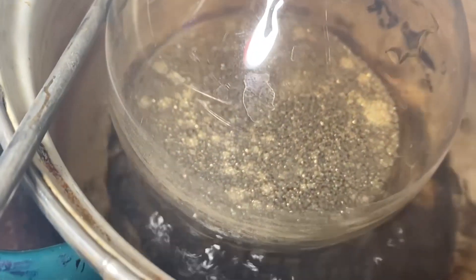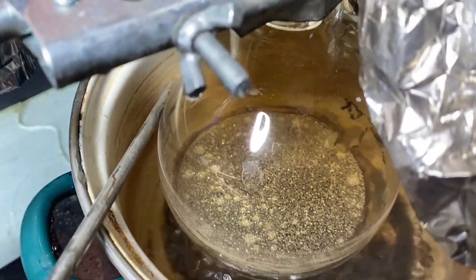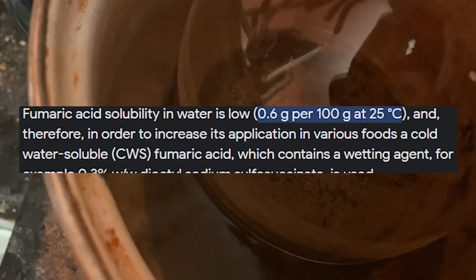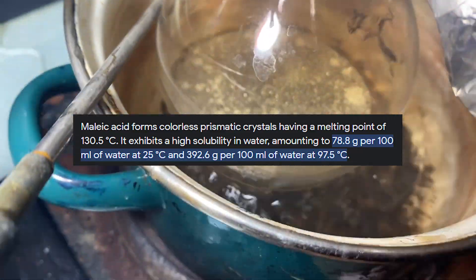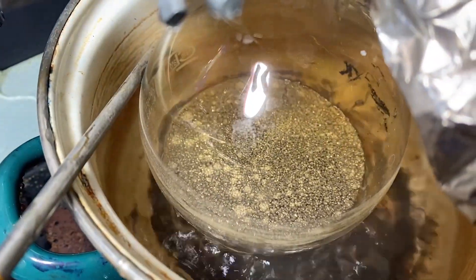Fumaric acid solubility is really low — in fact, it's so low that it's given as one milligram per milliliter. In contrast to maleic acid, which has a really high solubility in water, it's really easy to separate the two. So the solution was refluxed for around two hours.